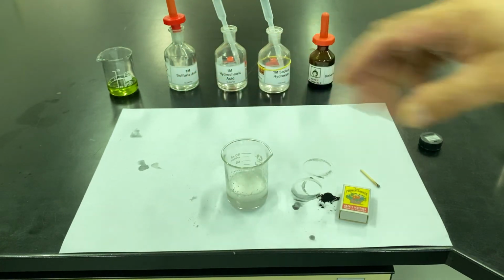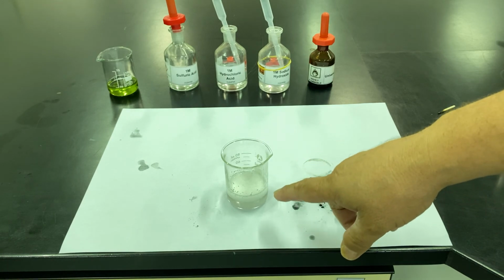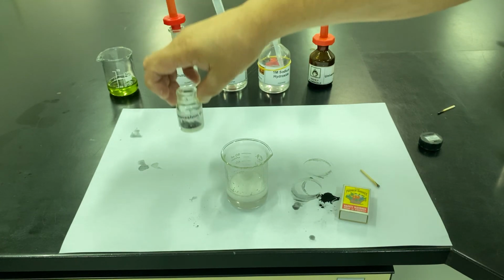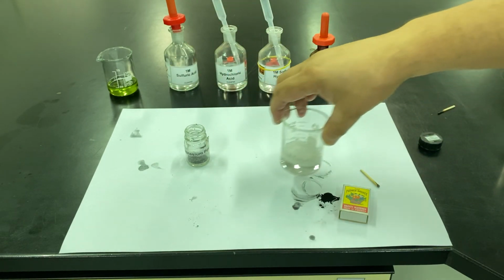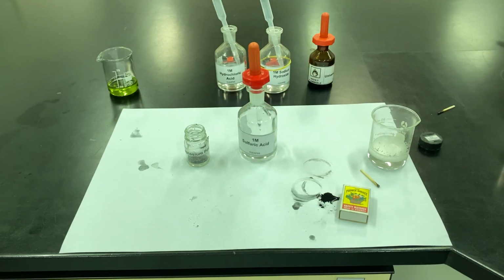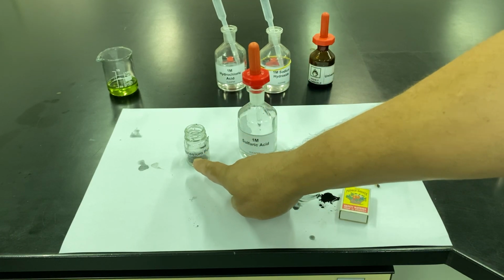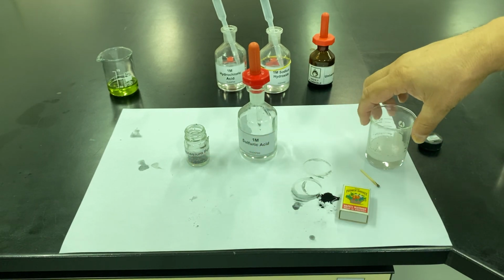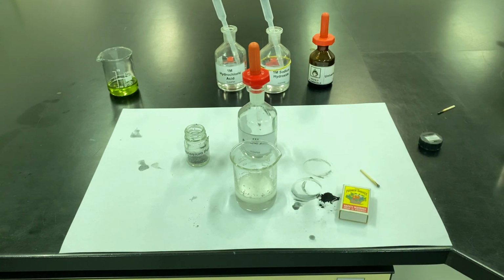Now one last thing. We've got hydrogen gas, but what's the salt that's produced? Well, here's a clue. We reacted magnesium with sulfuric acid. So the salt that was produced was magnesium sulfate. So we've got magnesium sulfate plus lots of hydrogen gas.